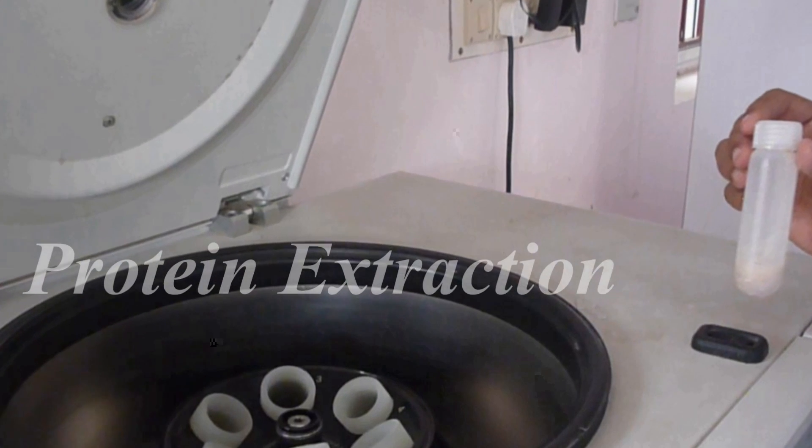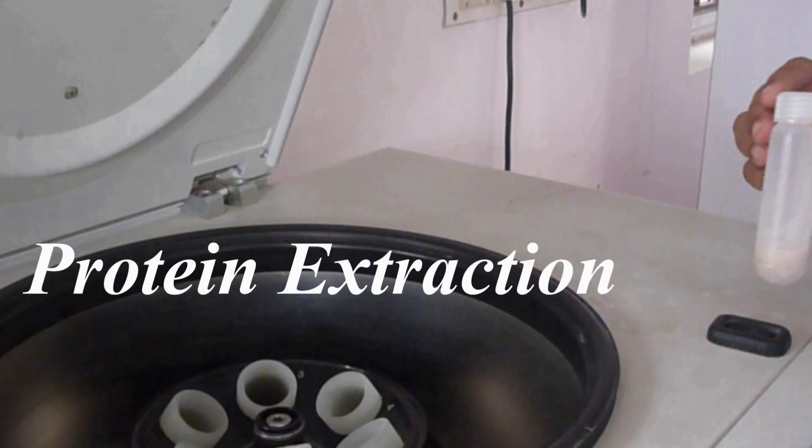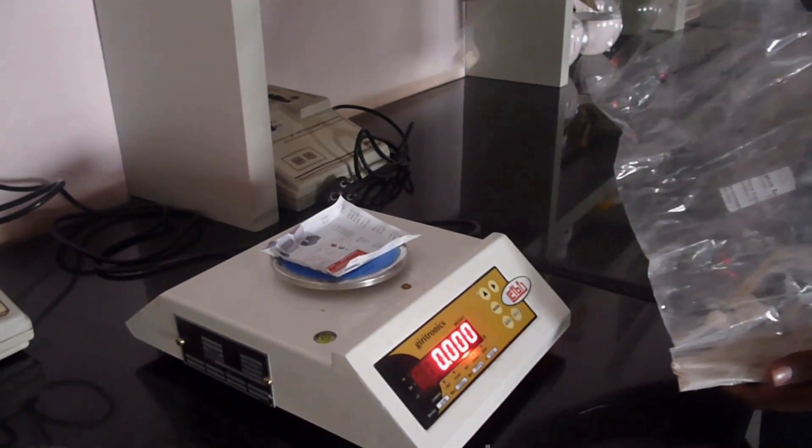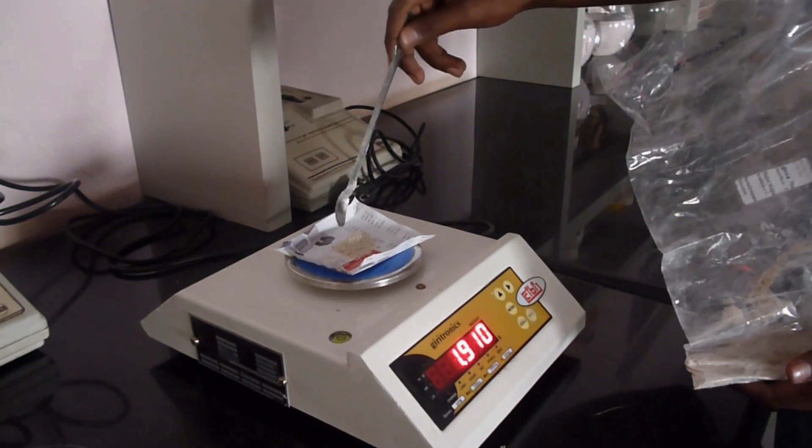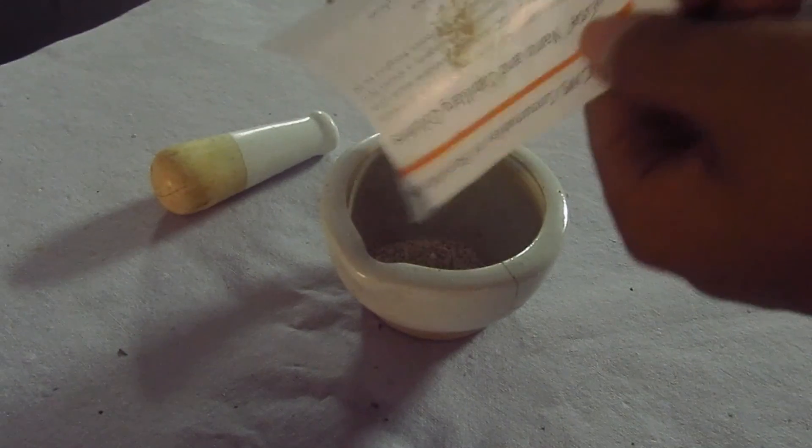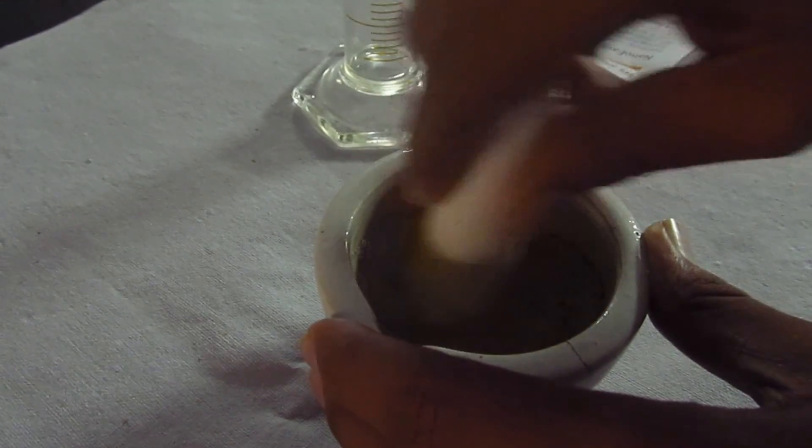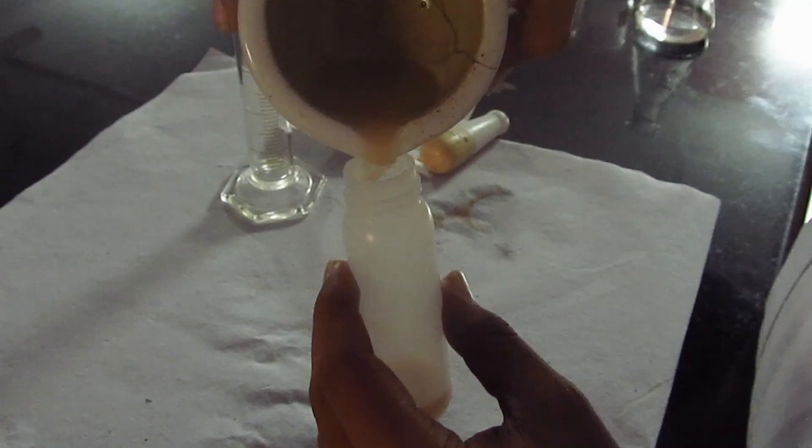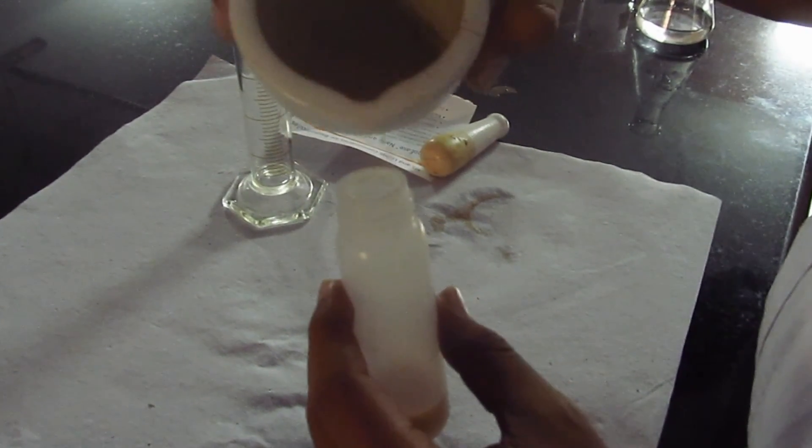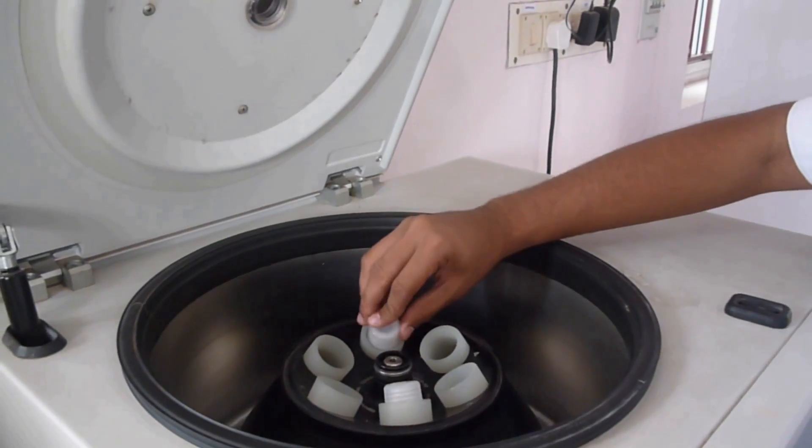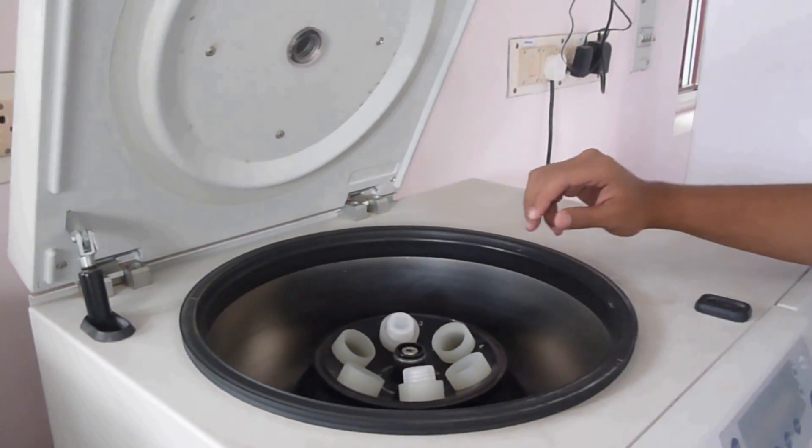Extraction of protein from the sample. Rice grains are taken and ground well to make it into a powder. Weigh 5g of rice grain powder and grind well with a pestle and mortar using 5ml of phosphate buffer. Transfer it to the centrifuge tube. Centrifuge it and use supernatant for protein estimation.